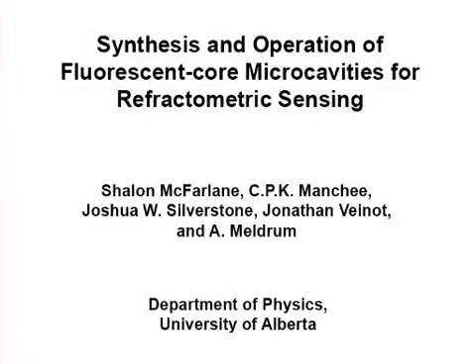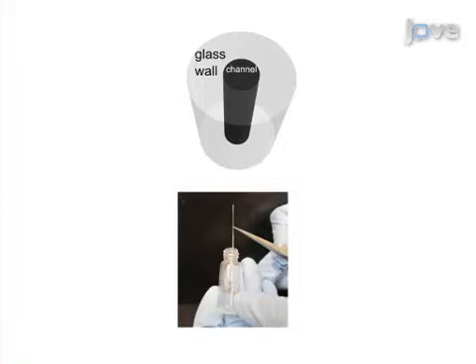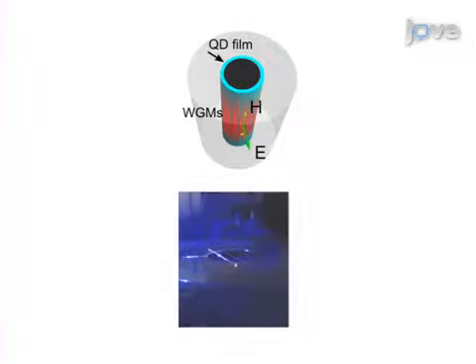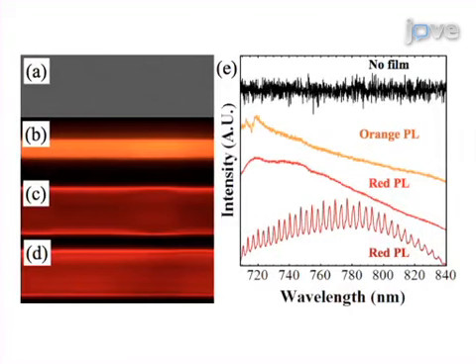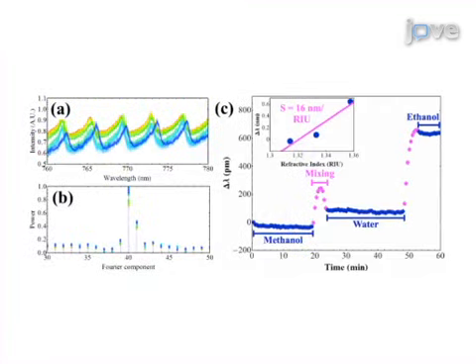The overall goal of this procedure is to develop a microfluidic sensor technology. This is accomplished by first fabricating potential devices by coating capillaries with a silicon quantum dot layer. The second step is to determine which of the samples meet the basic requirements for use as a sensor. Next, a sensor device is connected to a micro pumping system to allow the introduction of analytes.